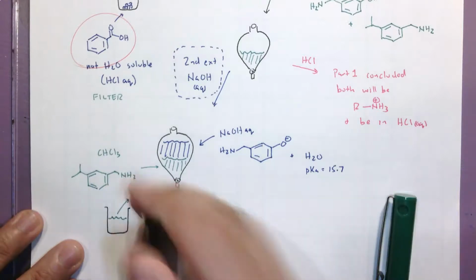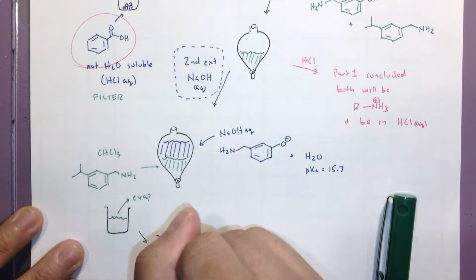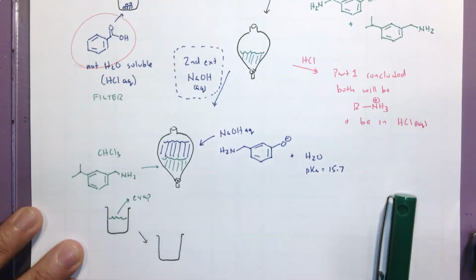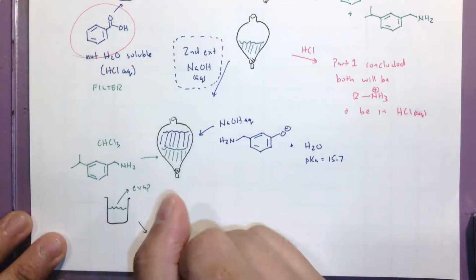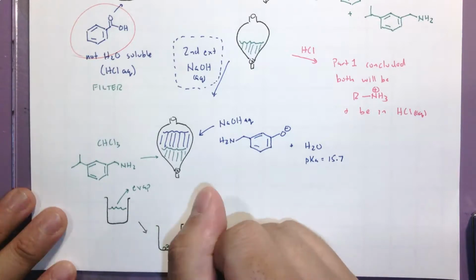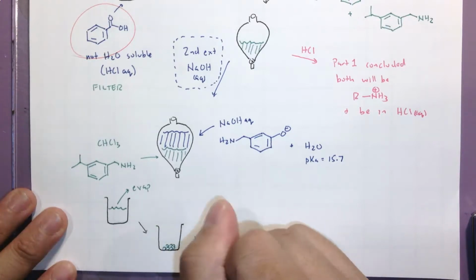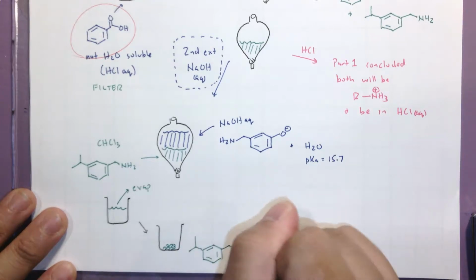You'll be left with a solid. There's no neutralization needed because it was never charged, and you have powder at the bottom. I know we're drawing these molecules a lot, but that is this molecule here.